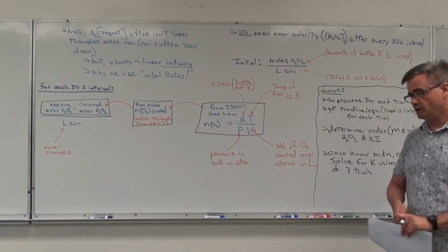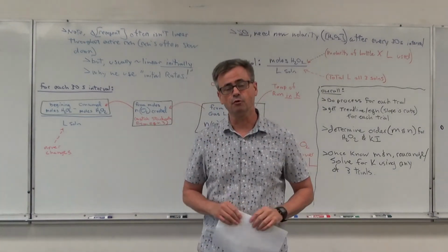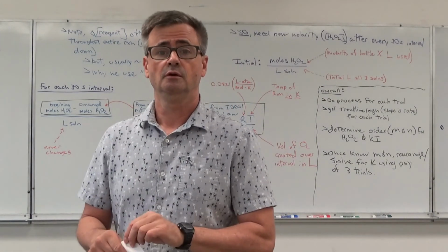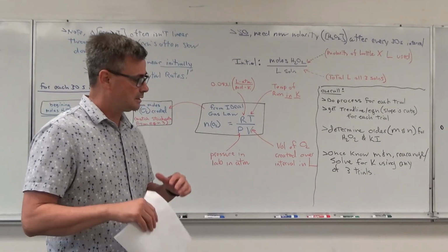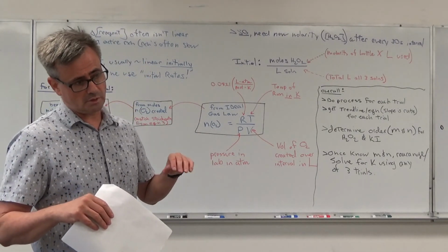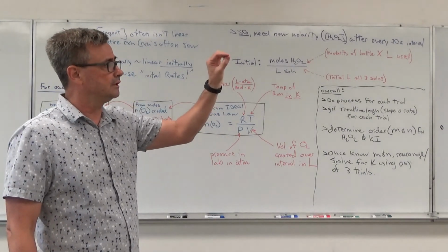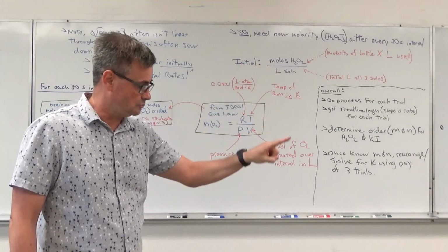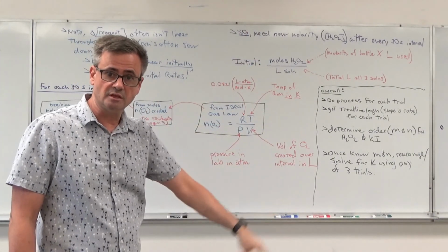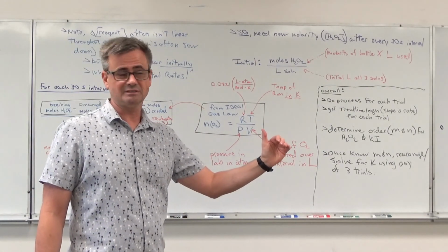Okay. One challenge for you guys on this may be just actually setting up your formulas within Excel. In general, once you've created your formula, you highlight it and drag on down so that it does the same thing for the rest of the intervals. You can check one of those intervals and see, does that make sense?